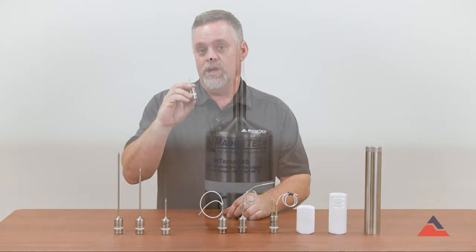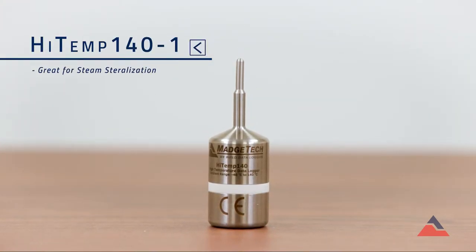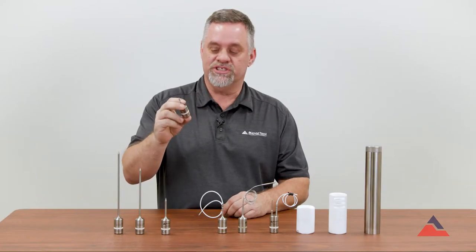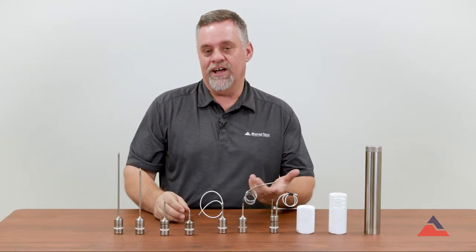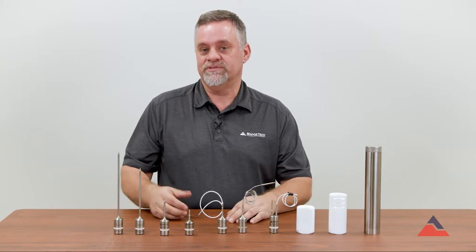The HITEM 140-1 is the perfect product for steam sterilization. It goes into an autoclave with your load, goes through a sterilization cycle, and it validates that your temperatures were hit for that sterilization cycle — time over temp.